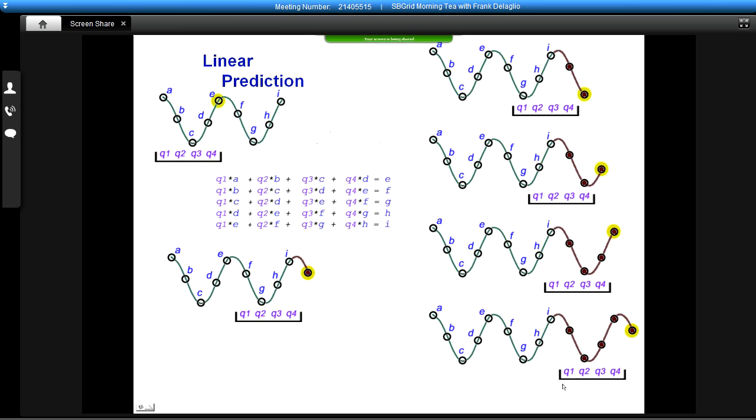Once we have these coefficients, we can add as many synthetic points as we wish to the end of the data. However, you can imagine that if the experimental data has any noise in it, then the corresponding coefficients will not be perfect. And so, as we continue to add more synthetic points that are based only on previous synthetic points, any noise in the experimental data and uncertainties in these coefficients is going to be amplified each time we add new synthetic points.